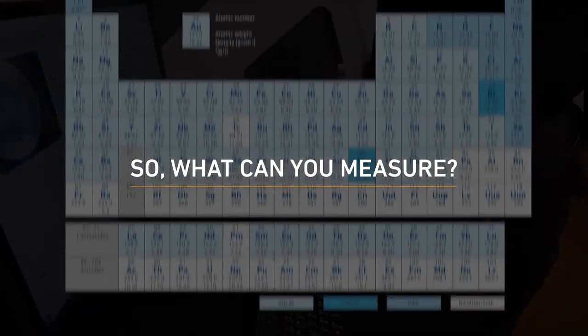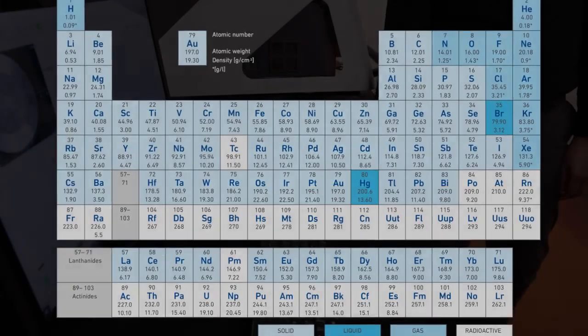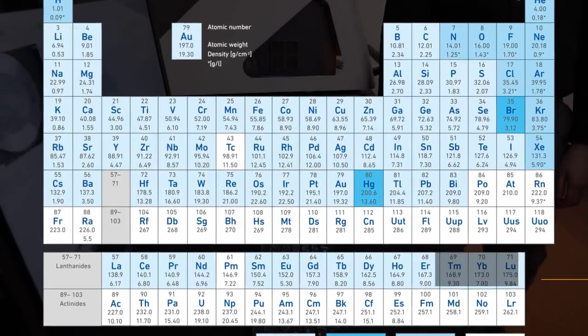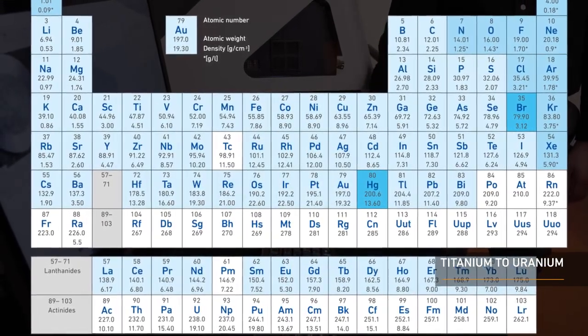So, what can you measure? You can measure a wide range of elements during your quality testing with just this one instrument, from titanium to uranium.